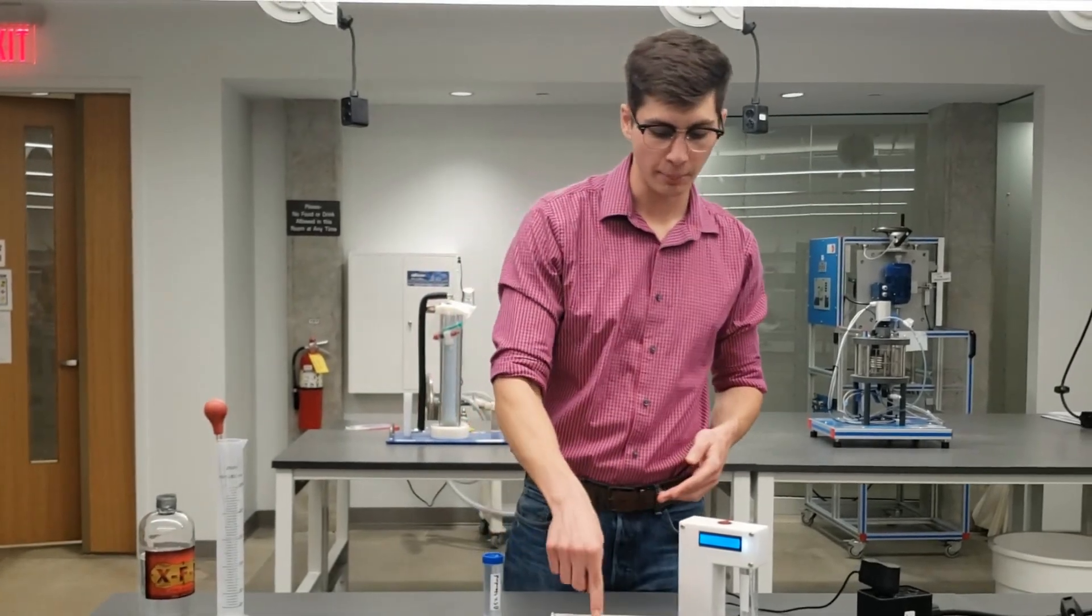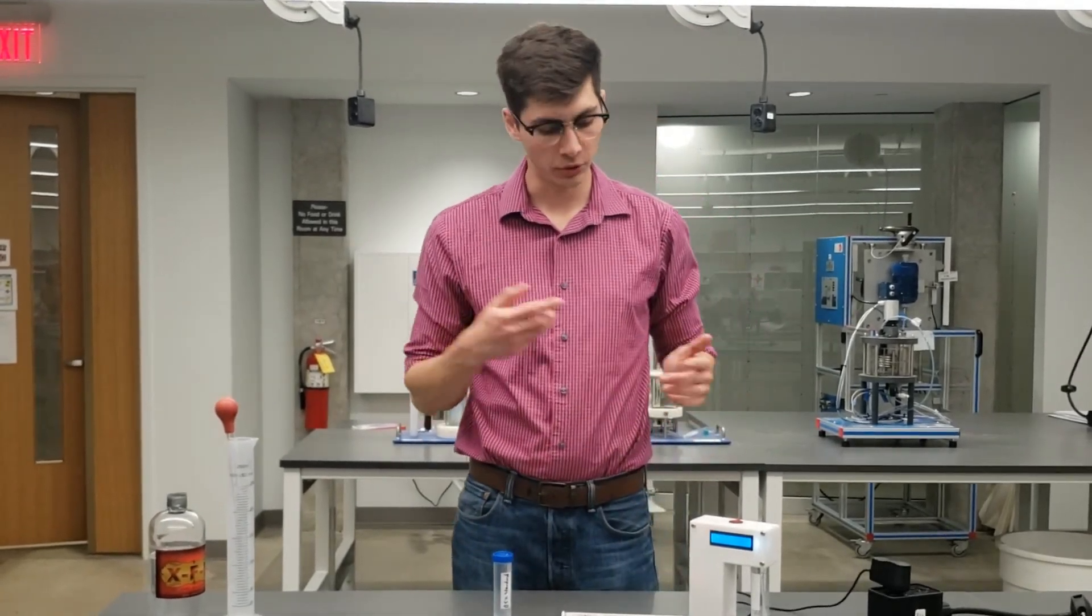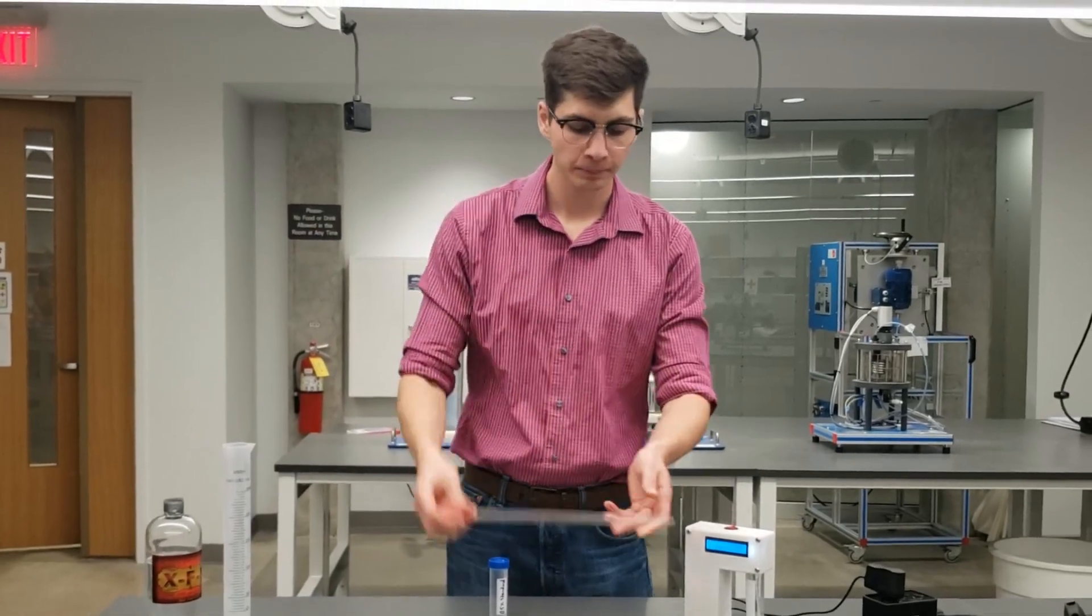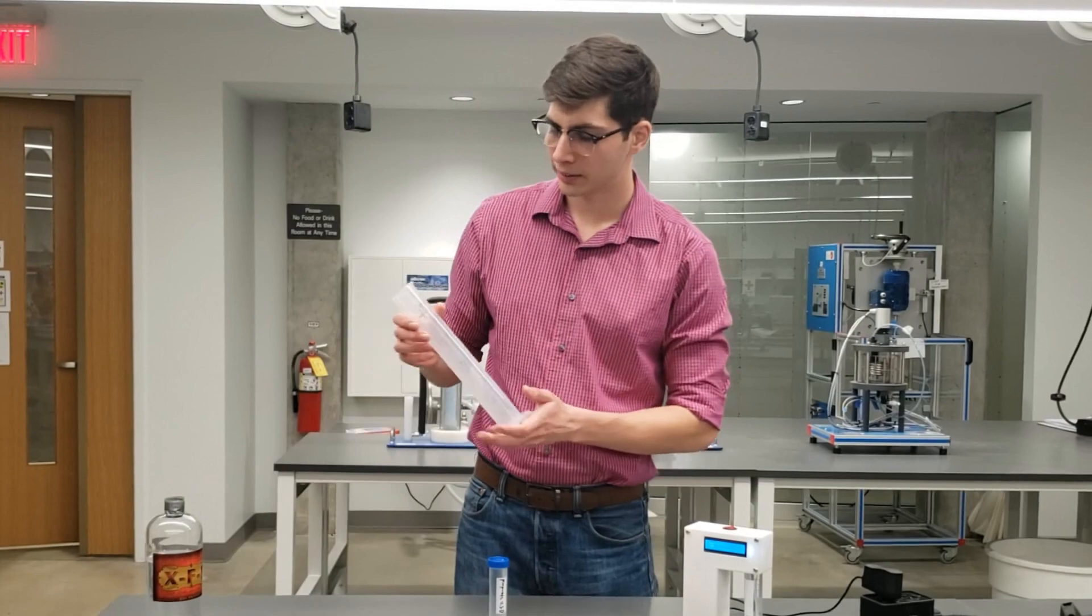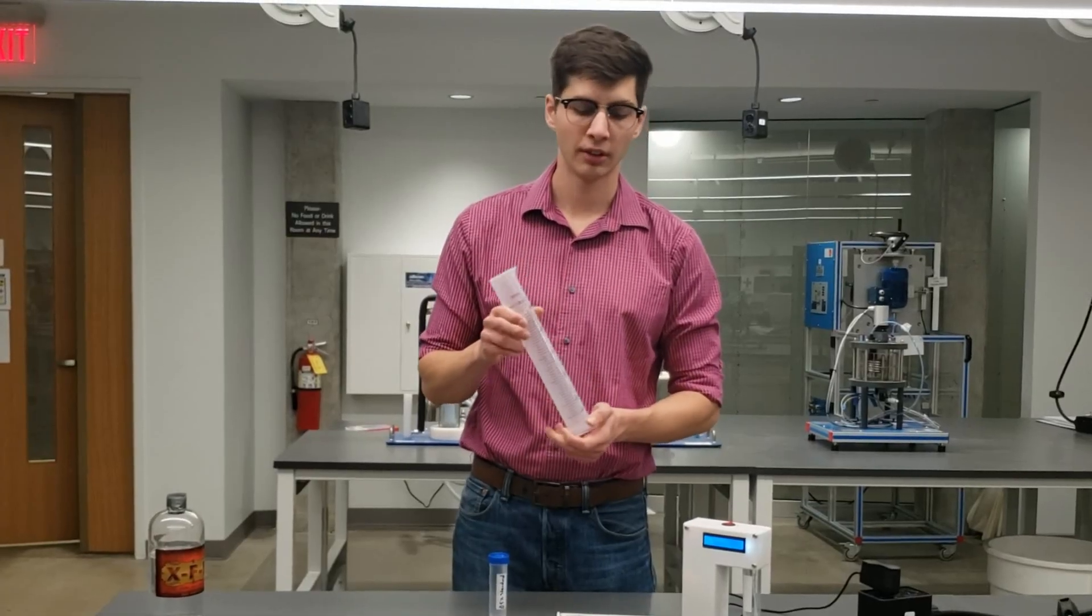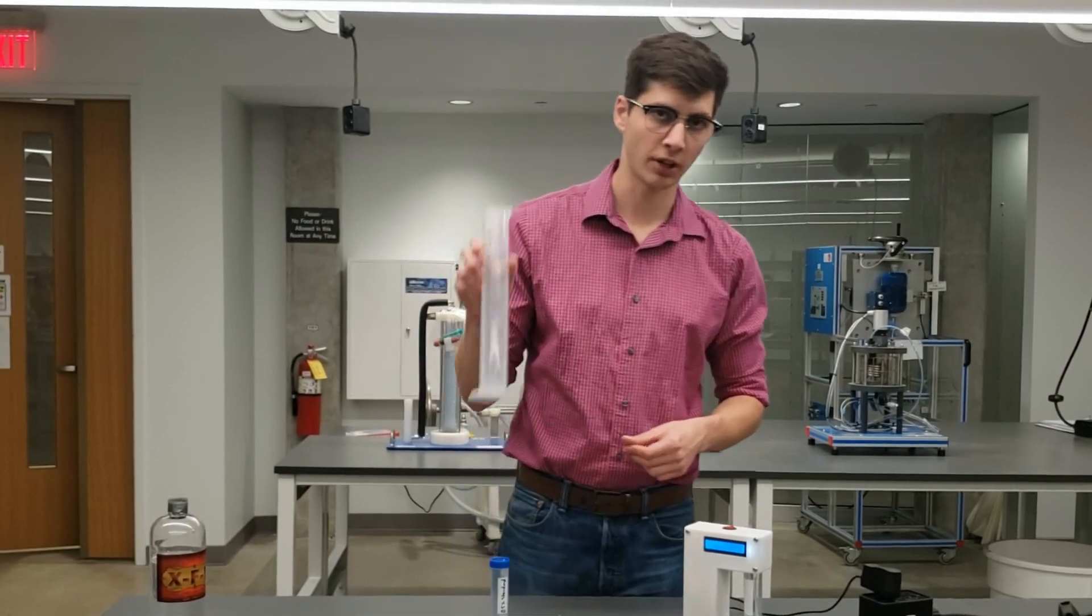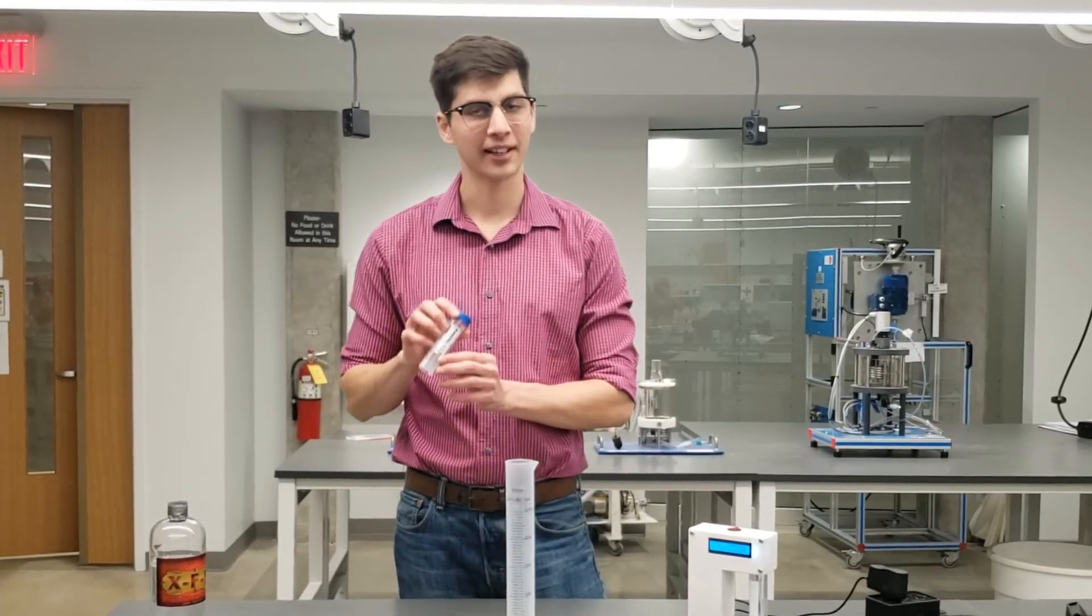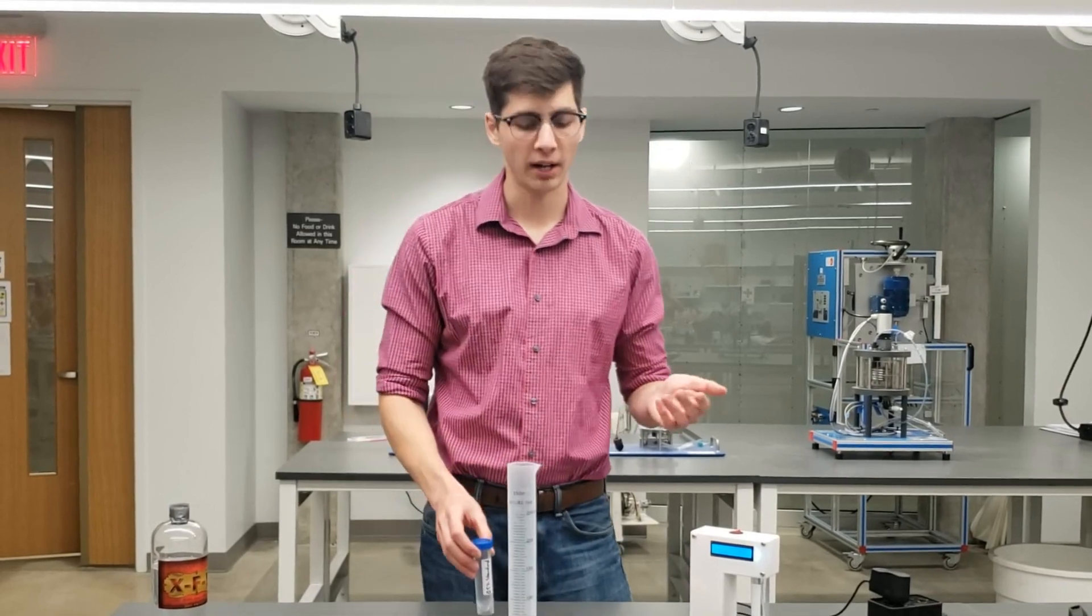Along with the pipette being a measuring tool to use with the alcohol detector, I would also recommend getting an accurate glass pipette as well as a 250 milliliter at least graduated cylinder in order to measure larger volumes.